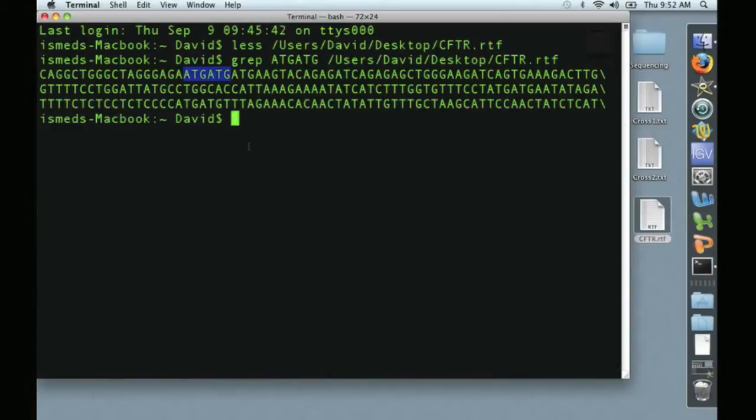I should note that GREP will only search within a line, so it won't find a repeat that wraps between two lines in the sequence. For that, you'll have to use something else.